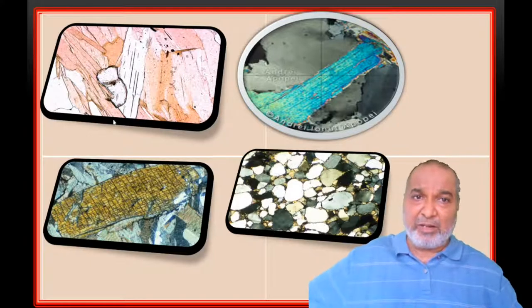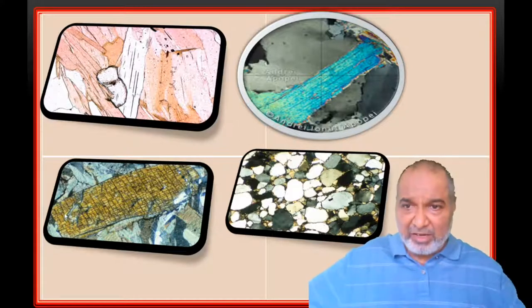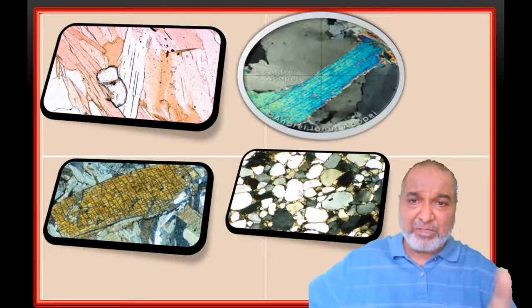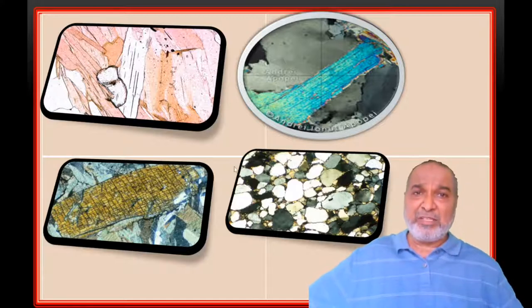which is a very clear one. Similar one, you can see this side. It is clear, one set is perfect. And now you can see here, it is parallel to the length, one set is there, and this is another one. So here we don't have any set of cleavage. So here, cleavage is absent. There we have two sets, and about one we have one set of cleavage.